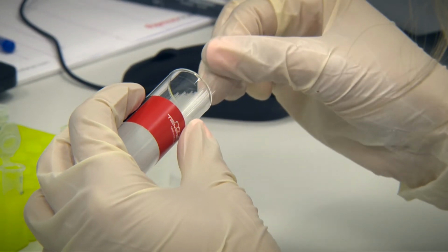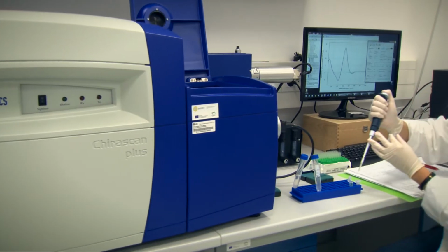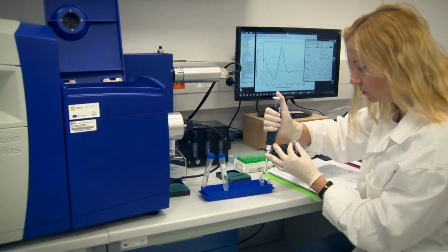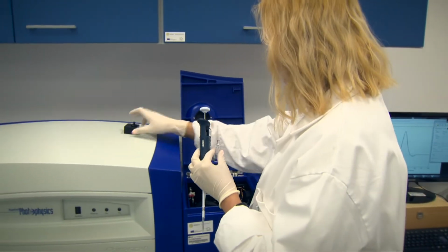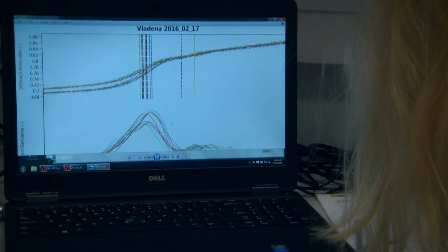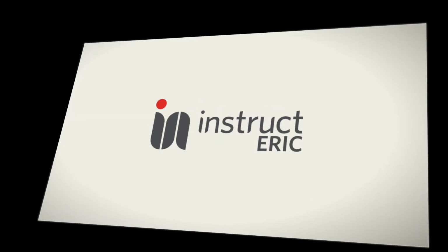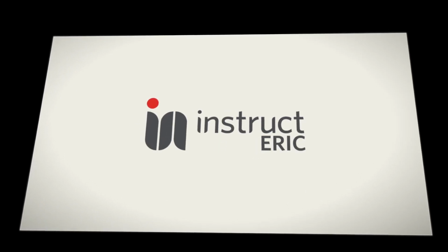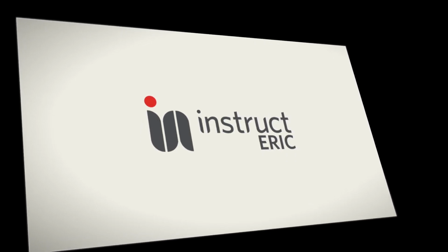As the next step, pure proteins are characterized. We measure, for example, their thermal stability, stability in different types of solutions, or a degree of molecular ordering. Throughout the process, we work with tiny volumes of protein solutions under clearly defined conditions and in a sterile environment. For all molecular analyses, we utilize our involvement in the European infrastructure Instruct-ERIC.